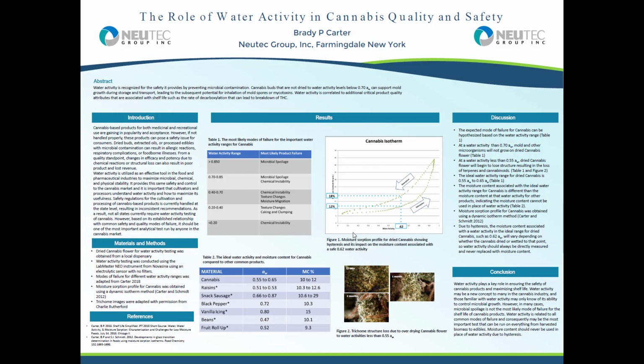And you'll notice that water activity is now starting to show up on most state regulations as a required test. The reason is because water activity is related to many different stability factors in cannabis, as well as in all types of other products. And water activity has been used for many years in the food industry effectively as a critical control point. It also has that level of importance in cannabis.